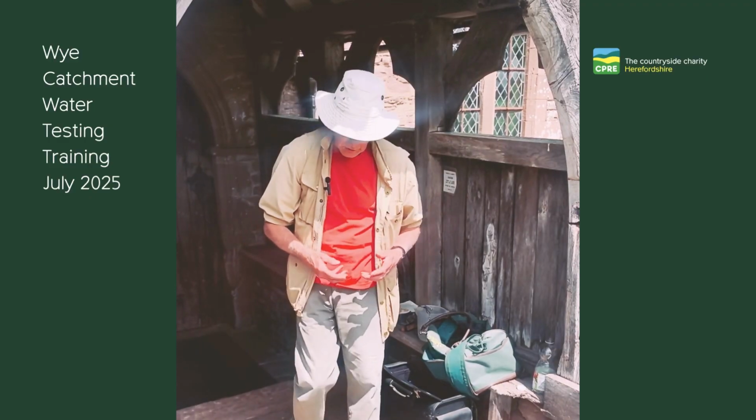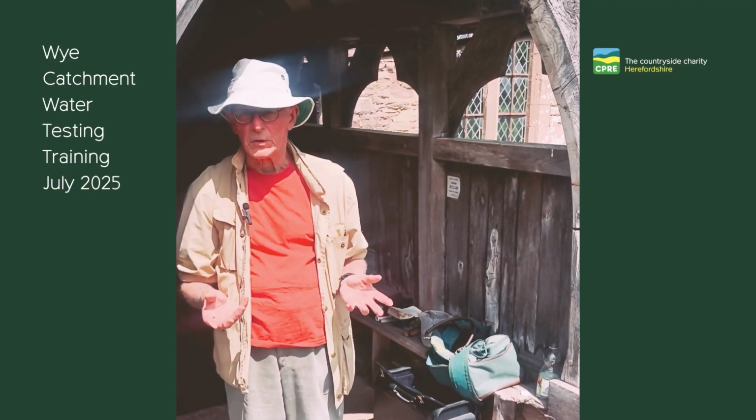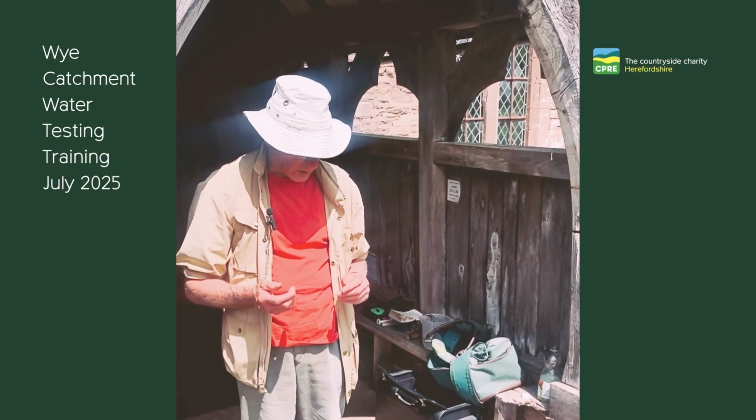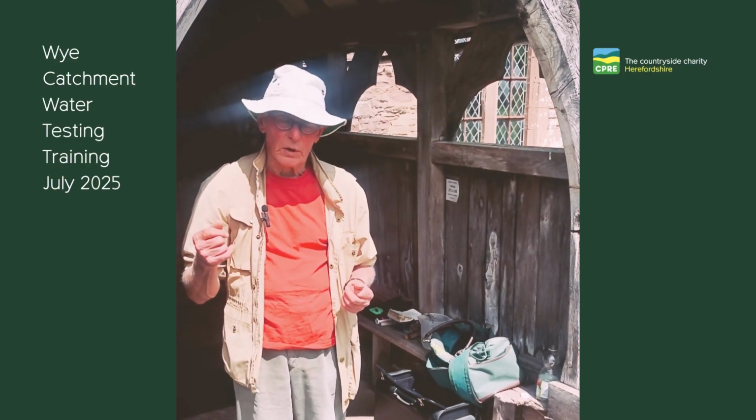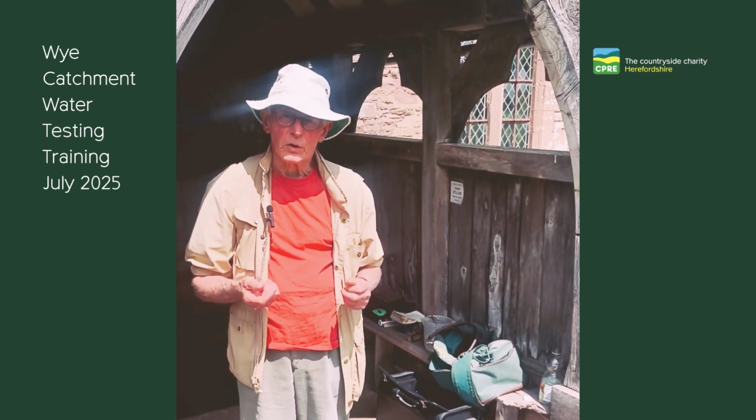So let's start with turbidity. Turbidity is basically a measure of whether or not water is clear or cloudy, to put it very simply. And on Epicollect, there is a simple observational measure of turbidity.